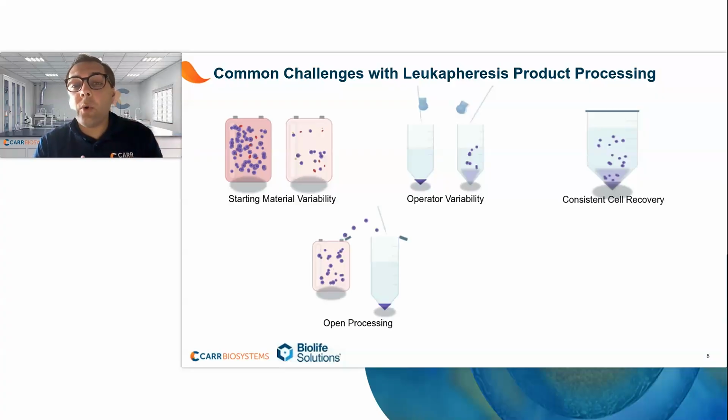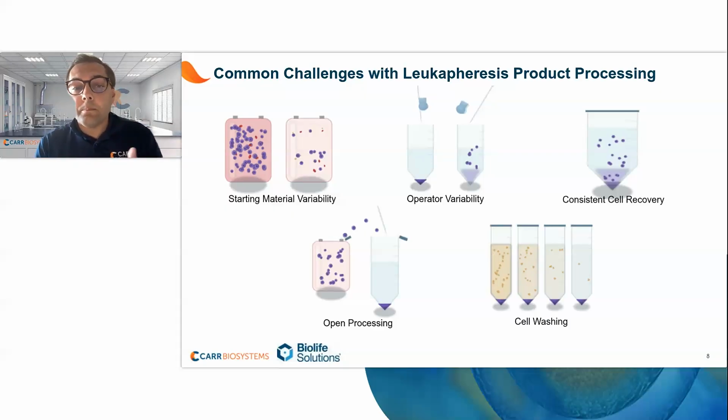Traditional technologies for leukapheresis processing tend to utilize open separation technologies. So being able to mitigate the challenge associated with open processing, from a sterility or contamination standpoint, can really play a factor in further development. And then we also have cell washing concerns. Cell washing is critical for platelet removal and other debris removal from that initial Leukopak. Being able to wash effectively in a fast processing time while removing debris is really critical for this initial Leukopak washing.